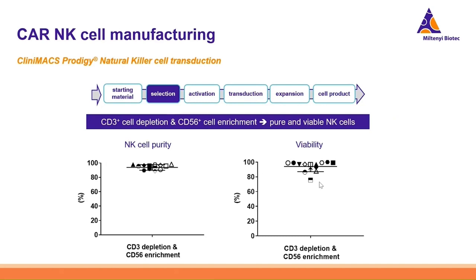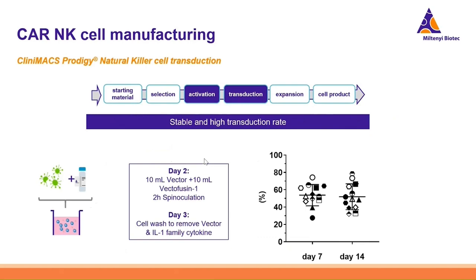viability. We do a transduction at day 2. Every protocol is different. You might be doing something different, but it's fine. We have learned that using vectofusin-1, like Julia showed, enhances this transduction, and we're using spinoculation, and also in our hands, this enhances the transduction rate.